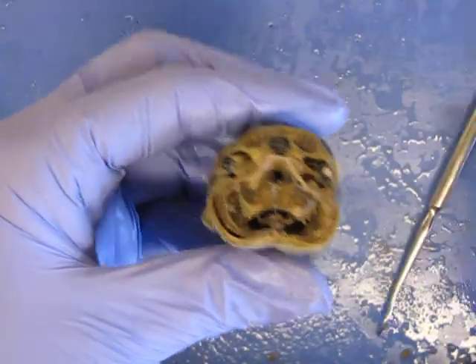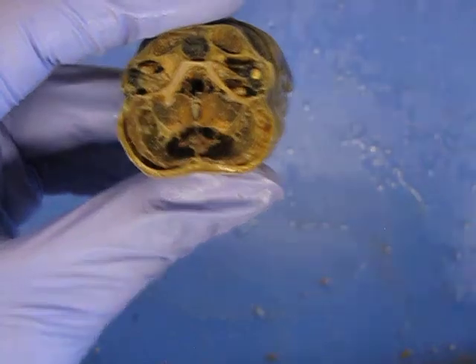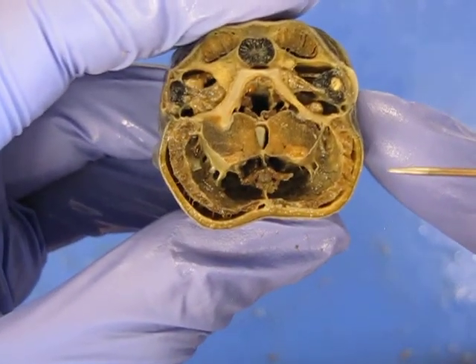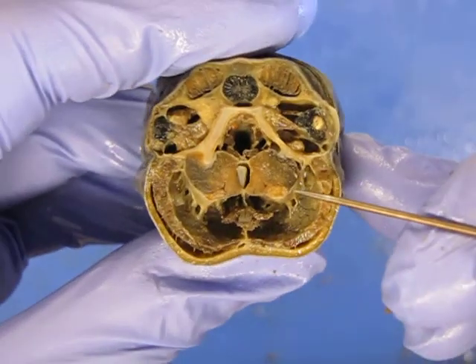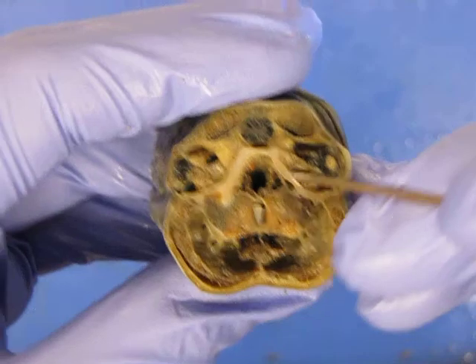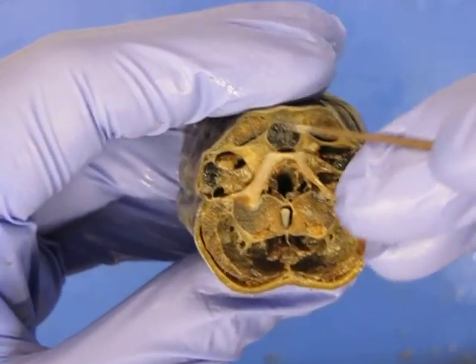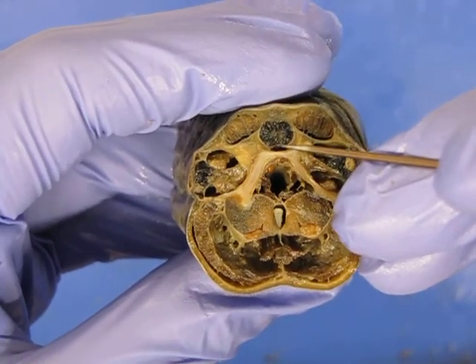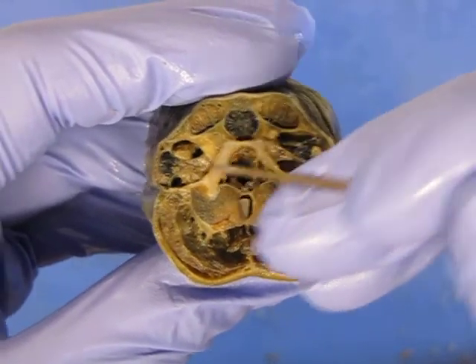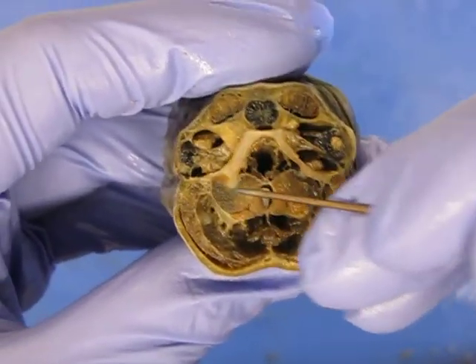But here you need to note, let me try to get this to focus again close. This is one of the important things that you don't see on sagittal section that you need to be able to see on cross section here. These right here. You should be able to see them under, or ventral to the olfactory sac, then go eyes, and then go ventral, and you'll see these muscles here.